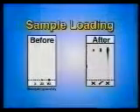Repeat the spotting procedure, keeping the baseline spot as small as possible. Allow the spots to dry either by standing in air or by blowing gently on the plate. You want a small diameter spot. With experience, you can judge how much sample is necessary. Too little, and you will not be able to see any spots on visualizing the plate. Too much, and the plate will be overloaded and no separation will be apparent.